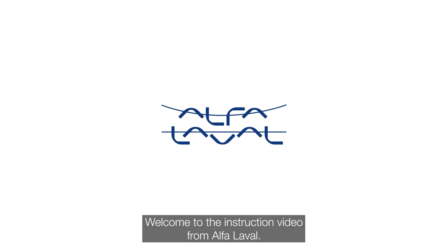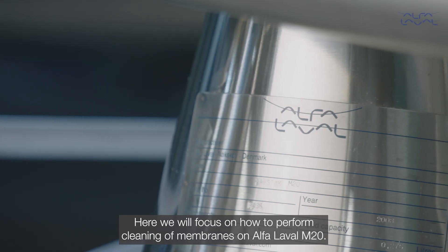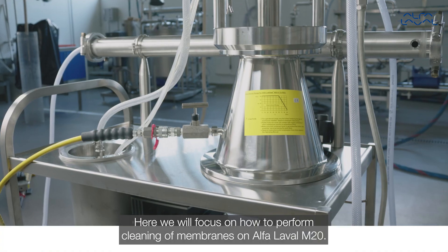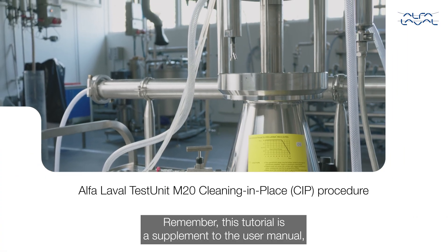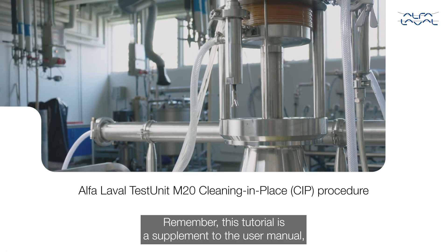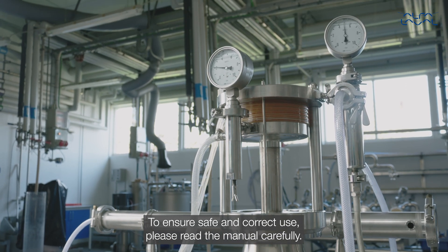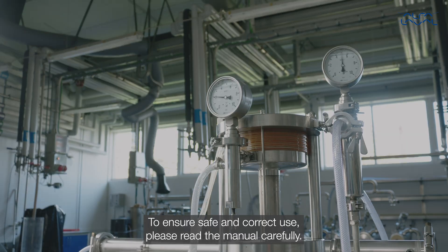Welcome to the instruction video from Alfa Laval. Here we will focus on how to perform cleaning of membranes on the Alfa Laval M20. Remember, this tutorial is a supplement to the user manual and does not replace it. To ensure safe and correct use, please read the manual carefully.